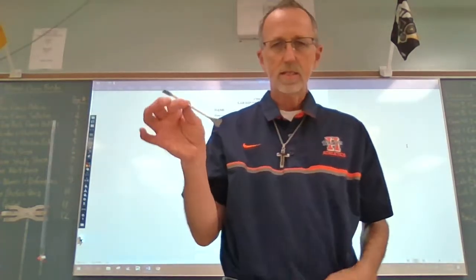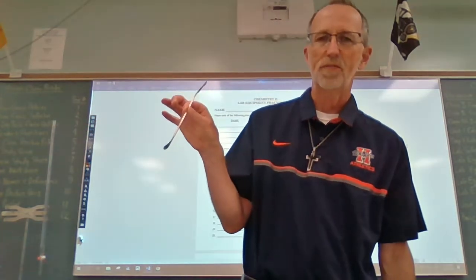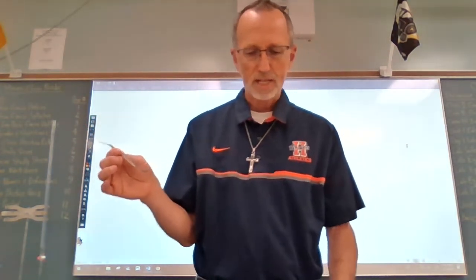Number 6, this is a spatula, right? It doesn't look like the spatula you have at home to fry eggs with or to turn a hamburger on a grill, but it is a spatula, all right? The spatula is used to transfer solid chemicals.